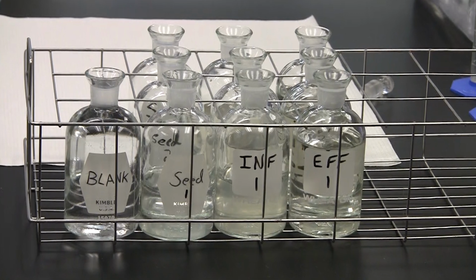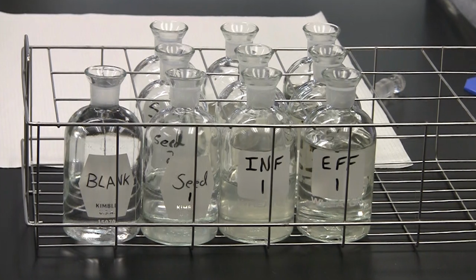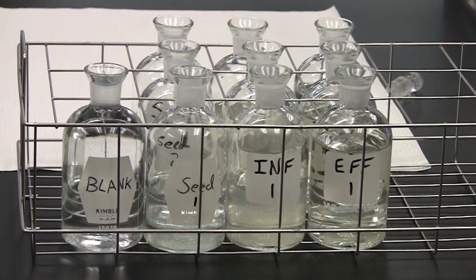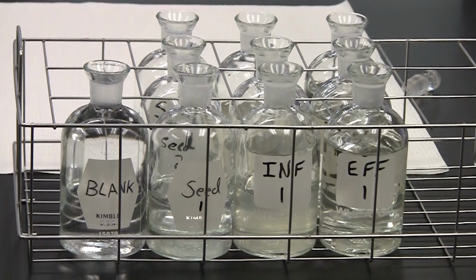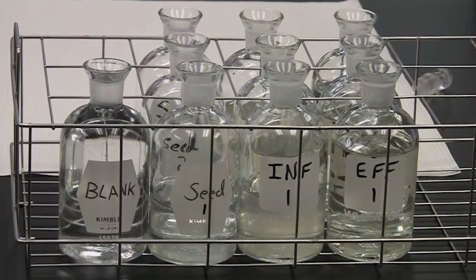You are now ready to prepare your sample bottles. Use at least 3 dilutions per sample in order to ensure that at least one dilution has adequate dissolved oxygen depletion and enough residual dissolved oxygen. Add your samples to each BOD bottle according to what is on your bench sheet. Based on your history, you will need to fine-tune your volume of sample used. There are guides available online to help determine the volume of sample you should use.